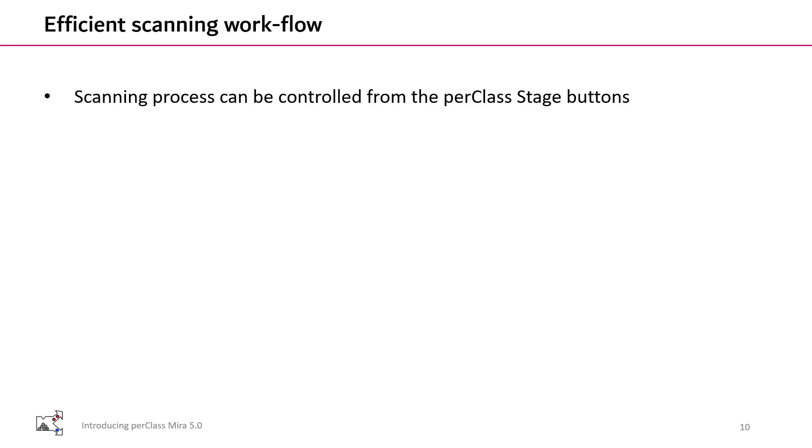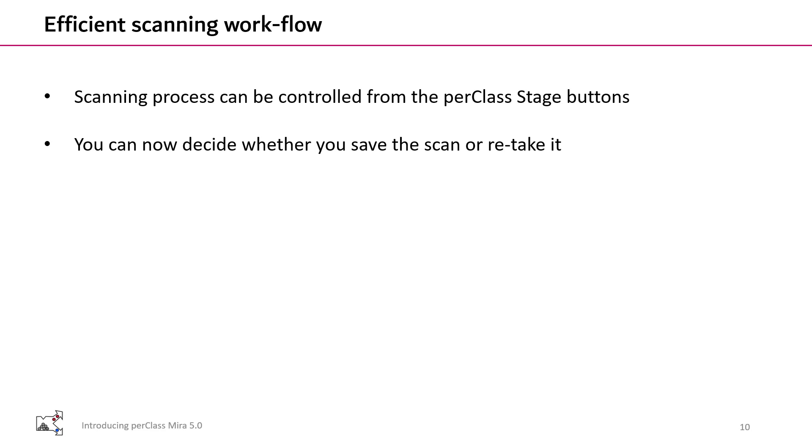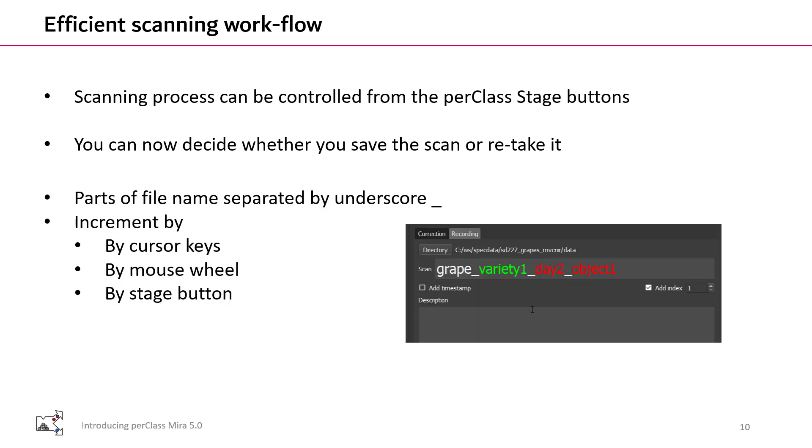The scanning process can be fully controlled from PerClass stage buttons. You can now also decide whether you save the scan or retake it. Parts of filenames can be separated by underscores. These parts can be then easily focused and incremented by mouse wheel, cursor keys or a stage button.